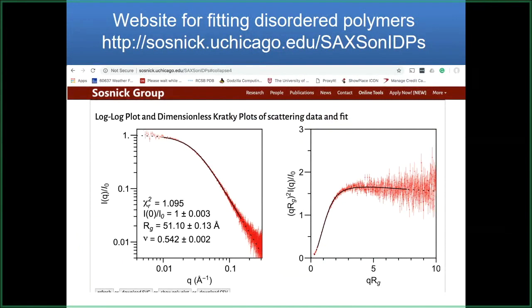All right, so you're bringing up a number of good issues. A couple of things. It could be that one region goes a little bit helical, and how do you deal with that? This model in principle is just appropriate for polymers where we have a little bit of stickiness. So yes, that's a confounding factor. Though it turns out that short stretches of helices are sort of random. They're sort of a random walk for short lengths.